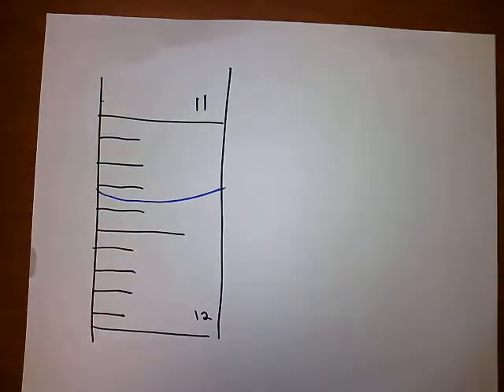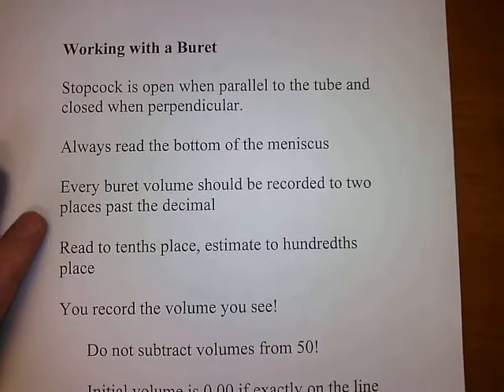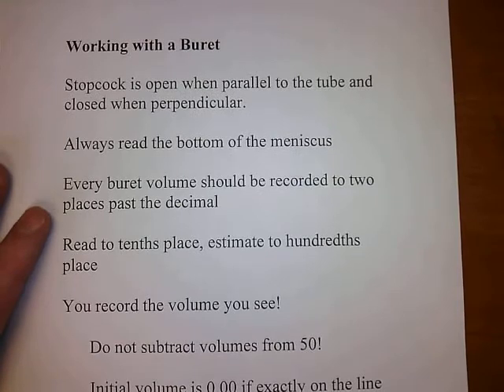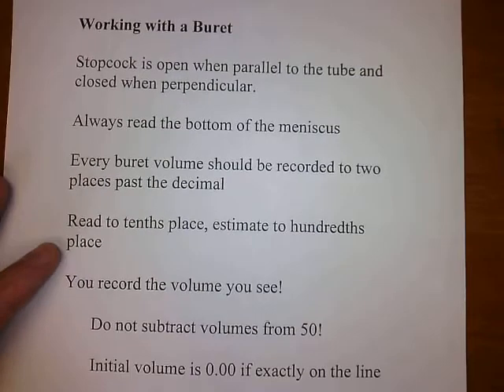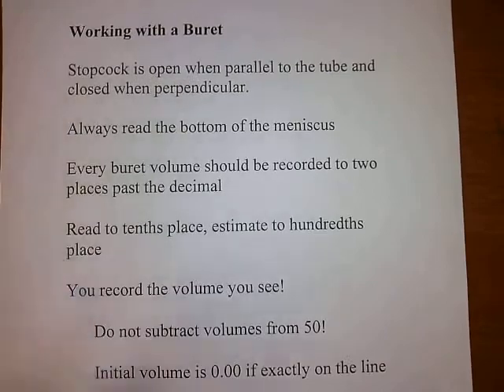Now, this is important in that every burette volume should be recorded to 2 places past the decimal. You read to the tenths and you estimate to the hundredths.